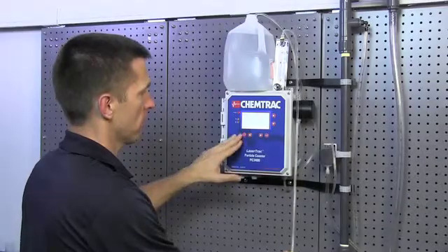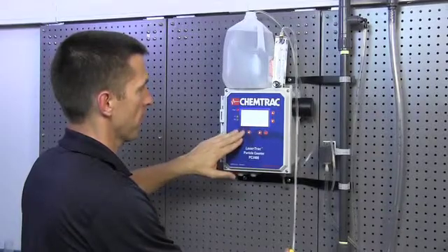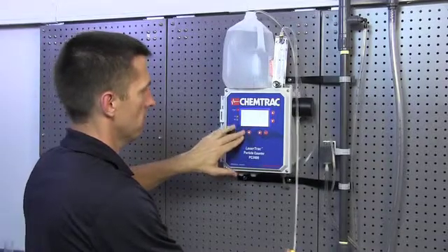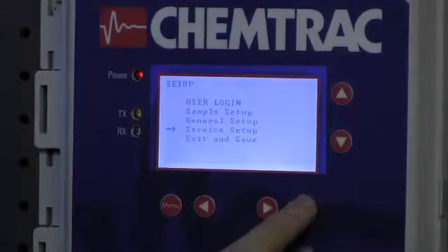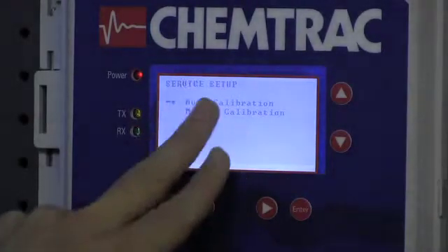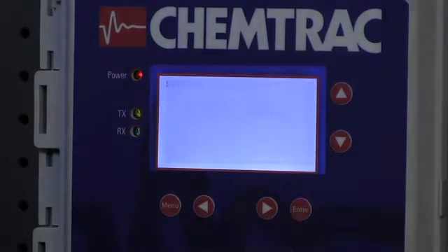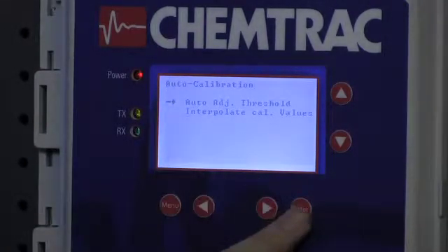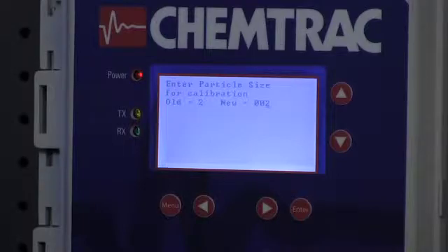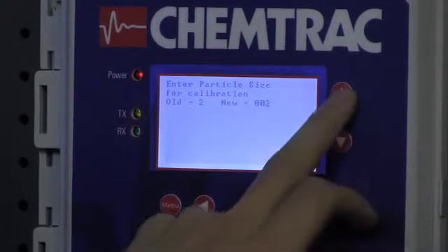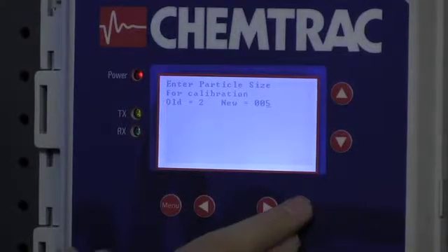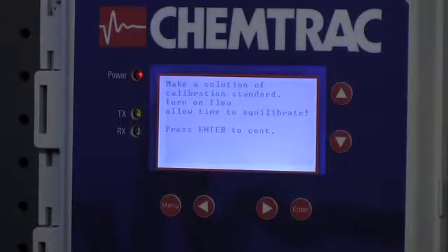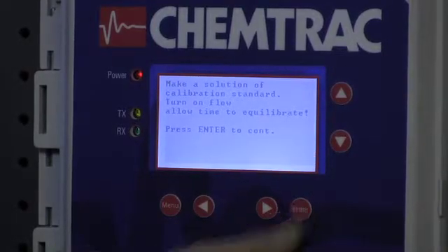So now we're going to go into the menu to calibrate the 5 micron spheres. We're going to hit menu, scroll down to service setup, and enter. Auto calibration, hit enter. Auto adjust thresholds, hit enter. And now we're going to tell it, using the up arrow, change that to 5, so we're telling the analyzer we're calibrating 5 micron. Hit enter. Make sure your flow rate is set for 75 milliliters per minute, and then hit enter to continue.